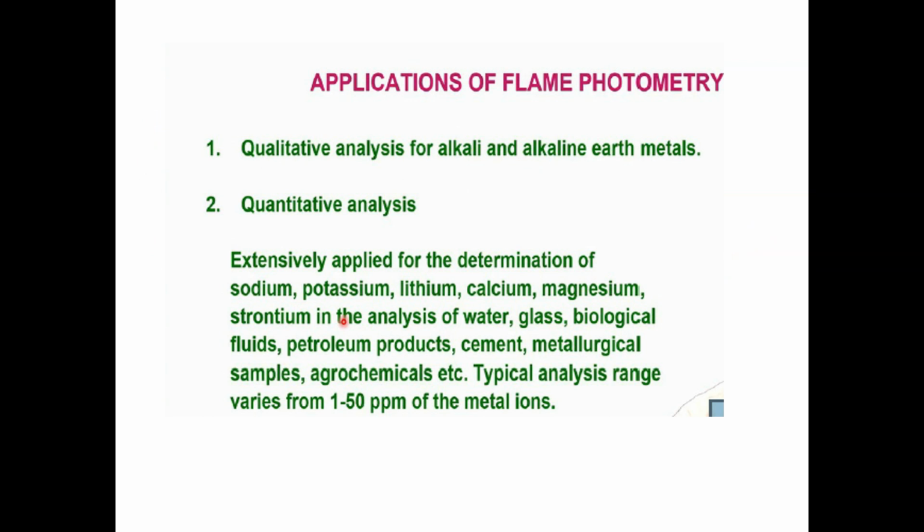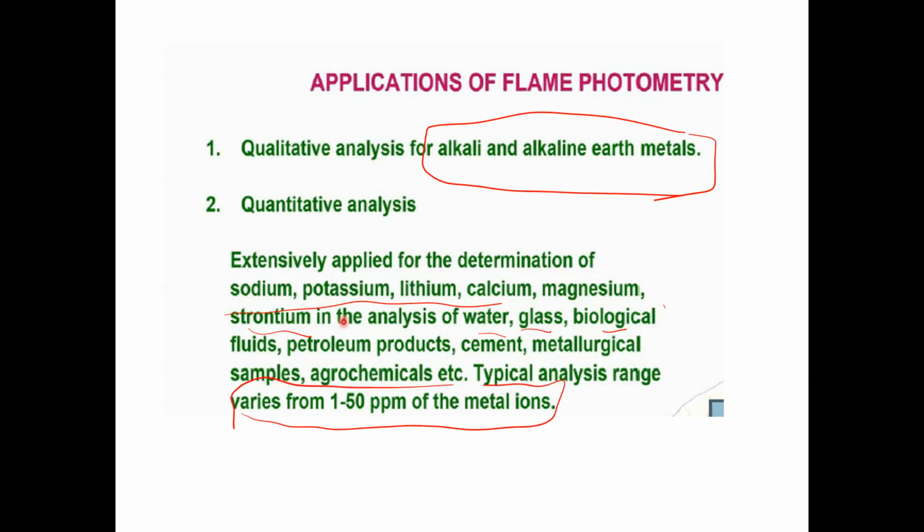First, it can qualitatively and quantitatively analyze the alkali and alkaline earth metals. Nowadays, it is extensively applied for the determination of sodium, potassium, lithium, calcium, magnesium, and strontium in the analysis of water, and different matrices such as glass, biological samples, petroleum products, cement, metallurgical samples, etc. So this is the typical range for which it works.